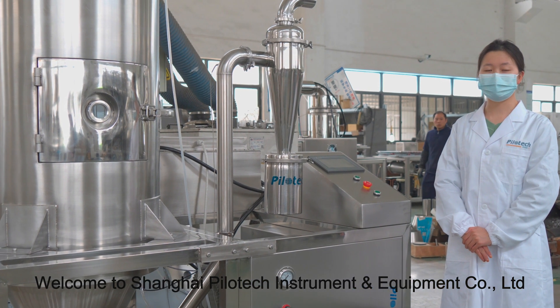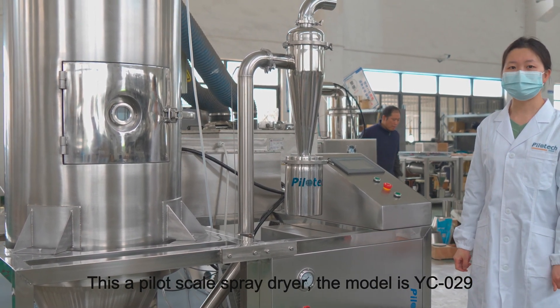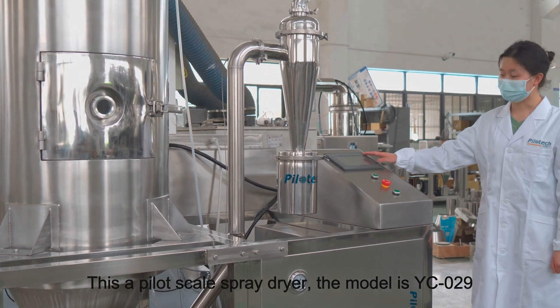Welcome to Shanghai PilotTag Instrument & Equipment Company. This is a Pilot Scale Spray Dryer. The model is YC029.